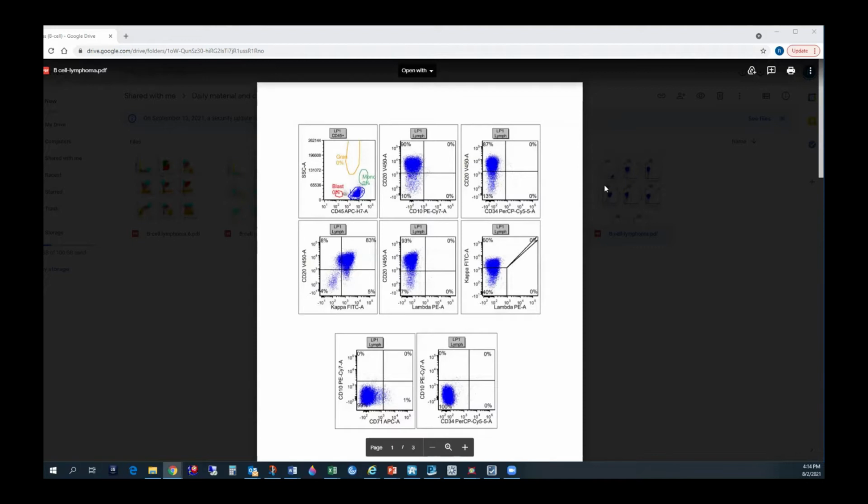We can move on. I have the next question. Yeah. I always used to think, I mean, I think there was an international group, some kind of discussion going on, maybe this, I'm not sure what they were discussing. I want to know how these lines are made. Like, the middle lines, some of them are at 10 to power 3, some are a little less than 10 to power 3, some a little more. Is there any specific way that these lines are made?